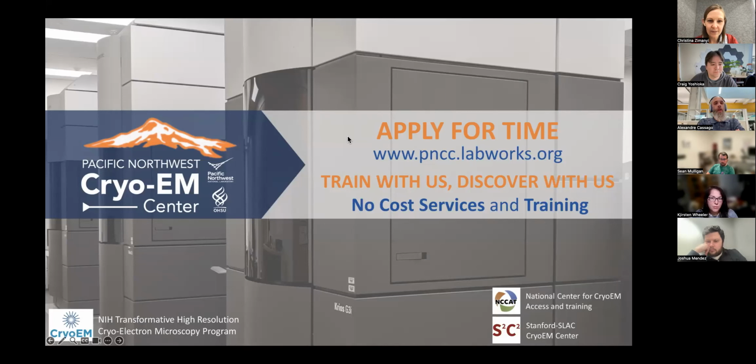PNCC has two types of proposals, the first being screening access, which allows one user to come on site for up to 5 days of sample preparation and screening with staff. This proposal is aimed at low resource institutions. And the second proposal type is general access, which awards up to 480 hours of microscope time for 2 years. This time can be used for screening or data collection.